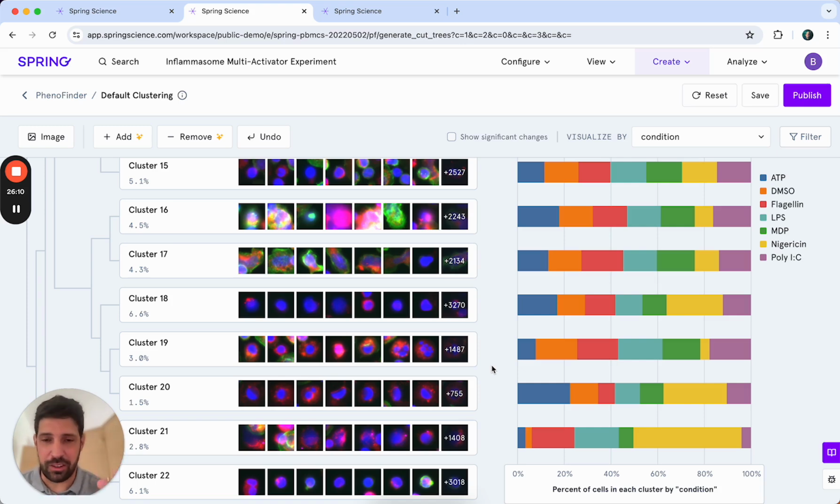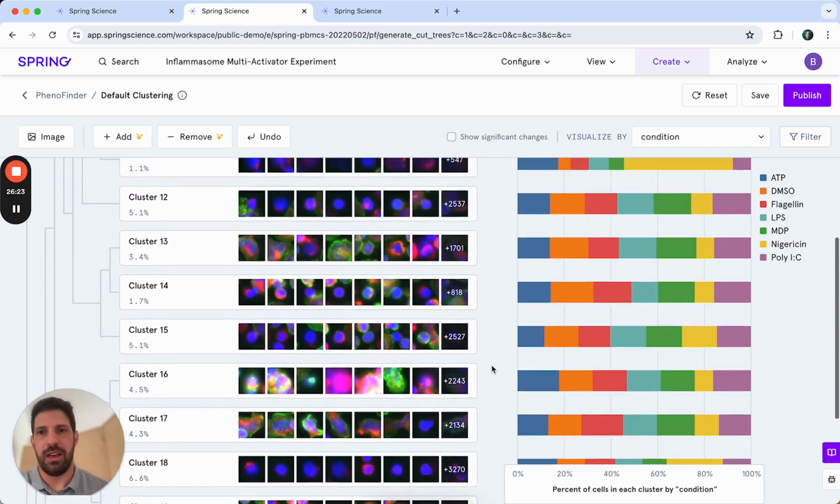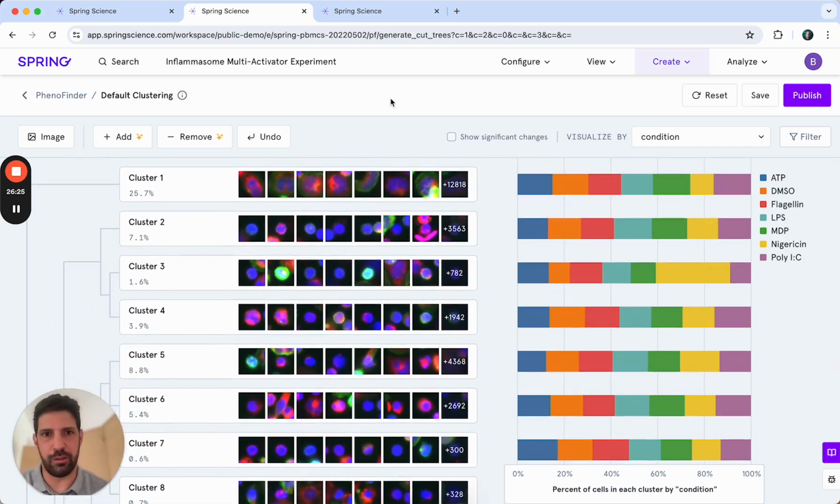And we discovered this phenotype, and then that led us to certain compounds that were inhibiting the formation of pores on the outside of the cells. It was stopping the pyroptosis from happening. That led to the mechanistic understanding of those compounds and even led to clinical trials running for those compounds. So this type of technology can be very powerful for novel mechanistic discovery and novel biological understanding.